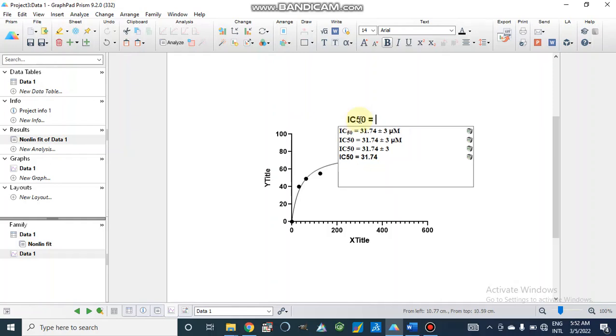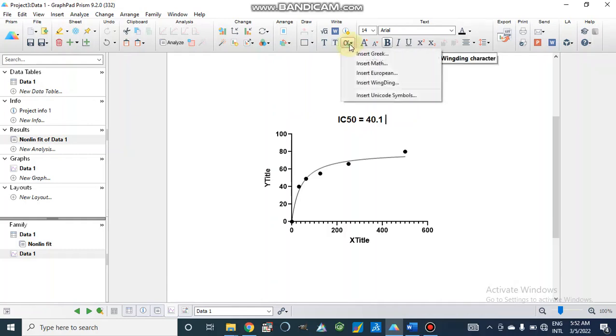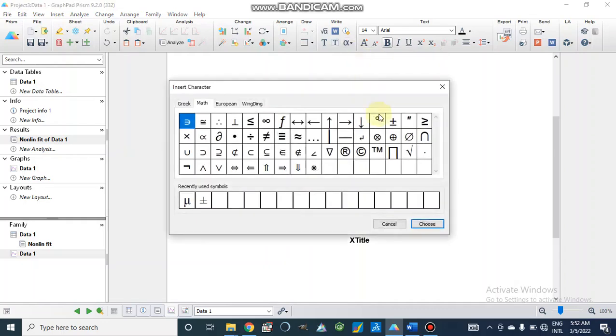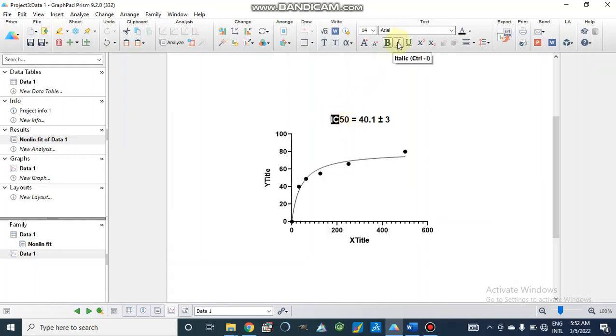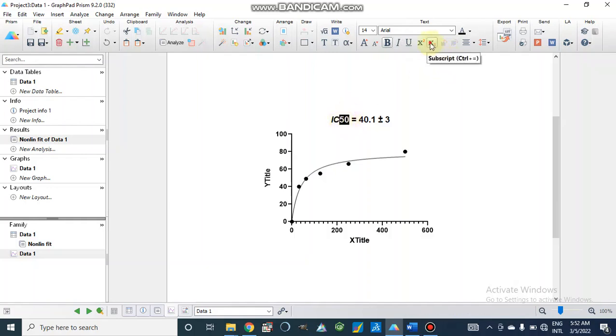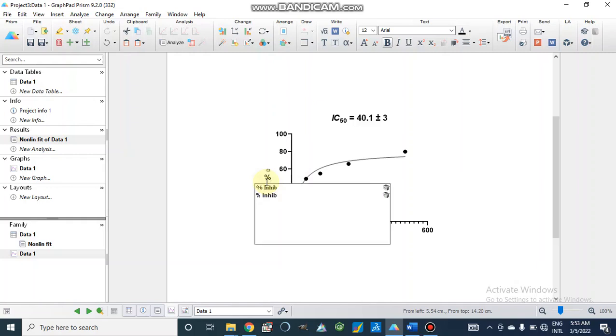We have 40 point something, and we have plus minus 3 degree of freedom. We can go to Symbol, insert plus minus, choose plus minus 3. Here we can make it IC50. For indexes we have inhibition percentage, so we will write inhibition percentage.